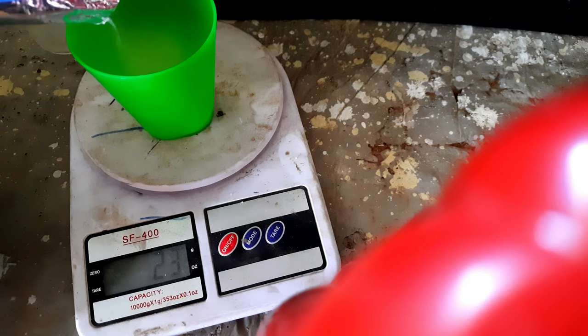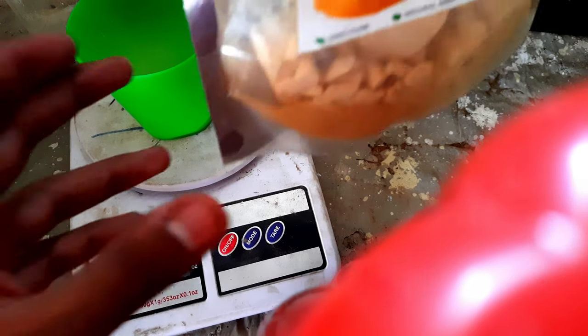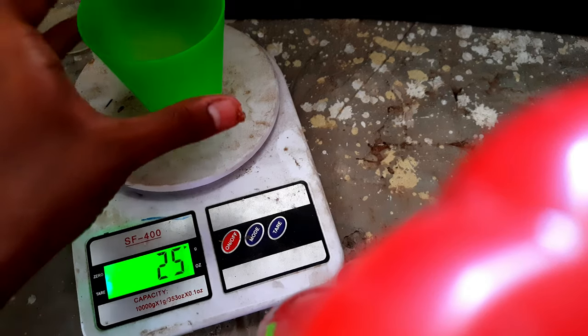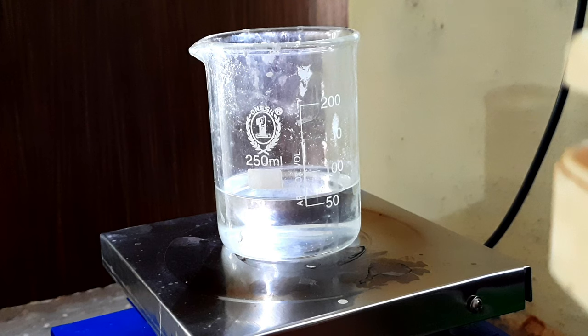Sorry about the speed of this video — it feels like it's going to take forever to complete. So I'm done weighing the contents out and I've made a mixture of the three components, and I'm going to be dumping all of this into the 62 milliliters of water. As I recently got a hot plate, I'm going to be using that.